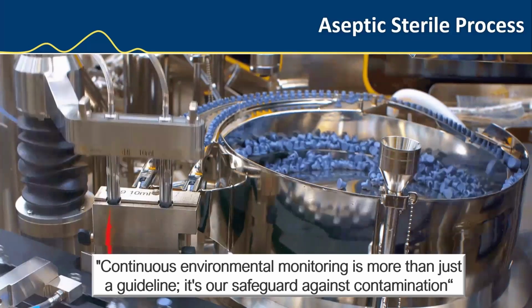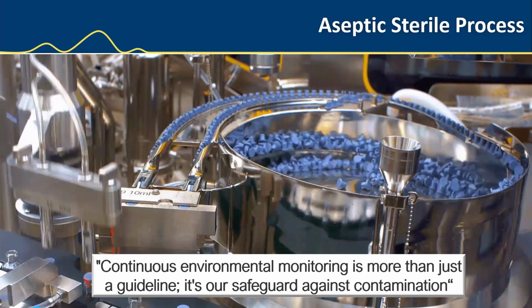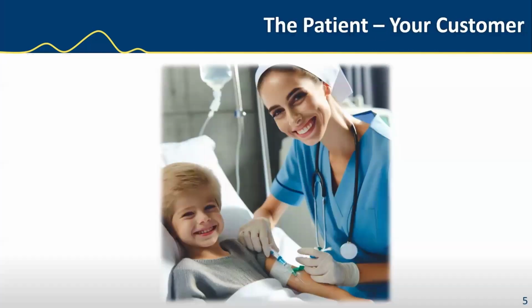So they do say that continuous monitoring is more than just a guideline, it's a safeguard against contamination. At the end of the day, these are patients, and we really need to be mindful that the product is going into a patient who has probably already got a compromised immune system. So that product needs to be safe and effective.